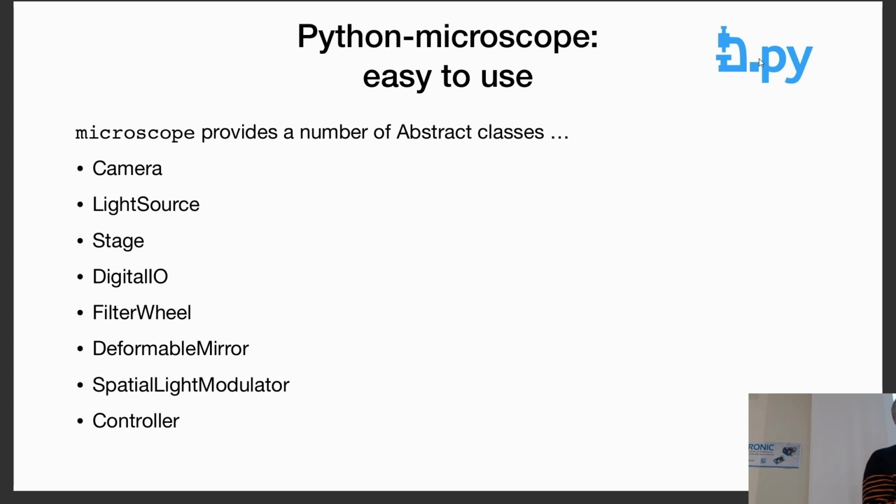You will see there are no regular microscopes. We don't provide support for these devices because they're complicated, the APIs are not really accessible, and we run into licensing issues to make it open source. It's essentially a library mostly developed for people that build their own microscopes.